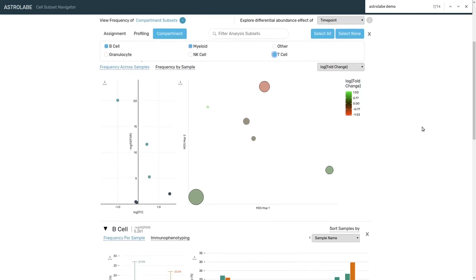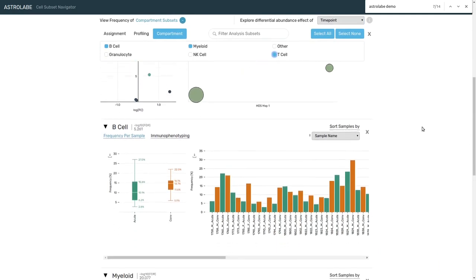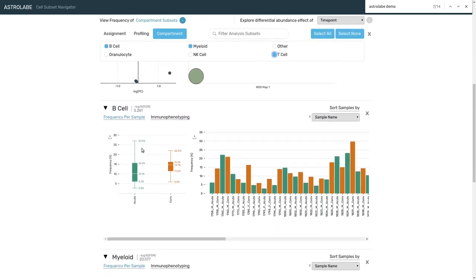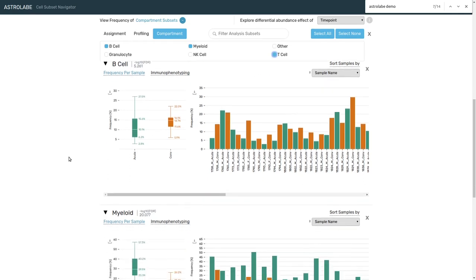So for the B cells, we see that there is an increase between the two time points from acute to convalescent. However, there is quite a bit of variability in the acute time point.